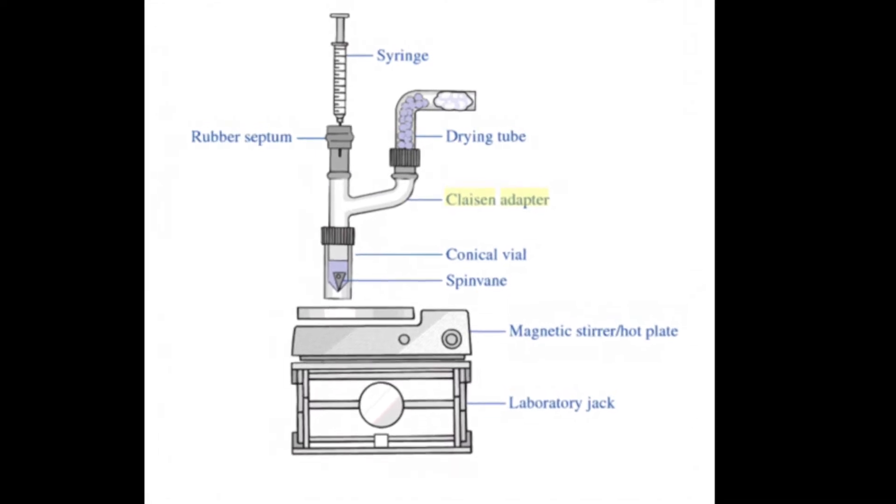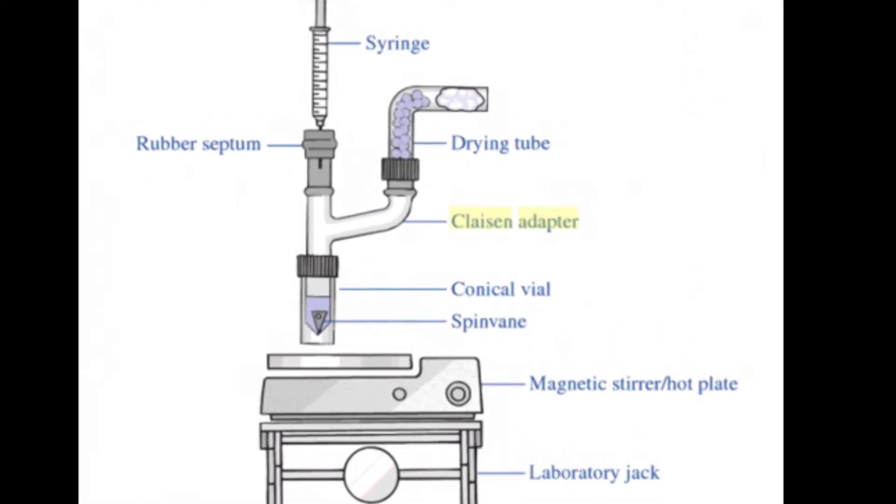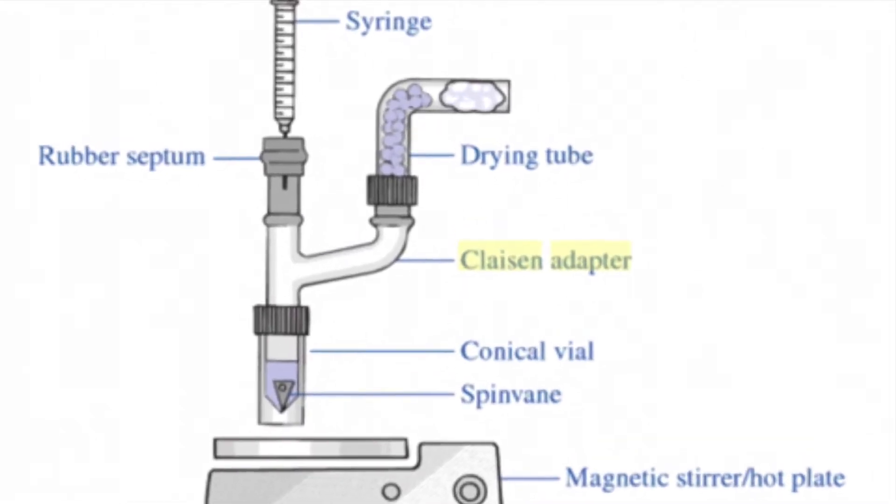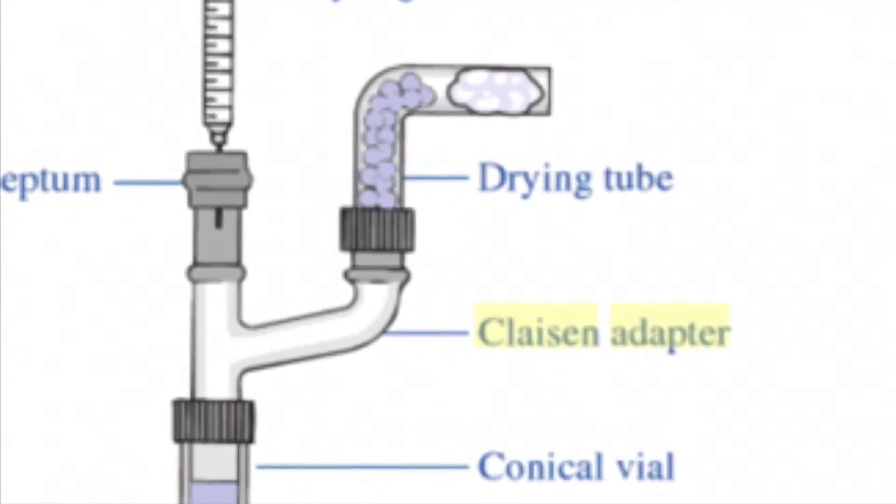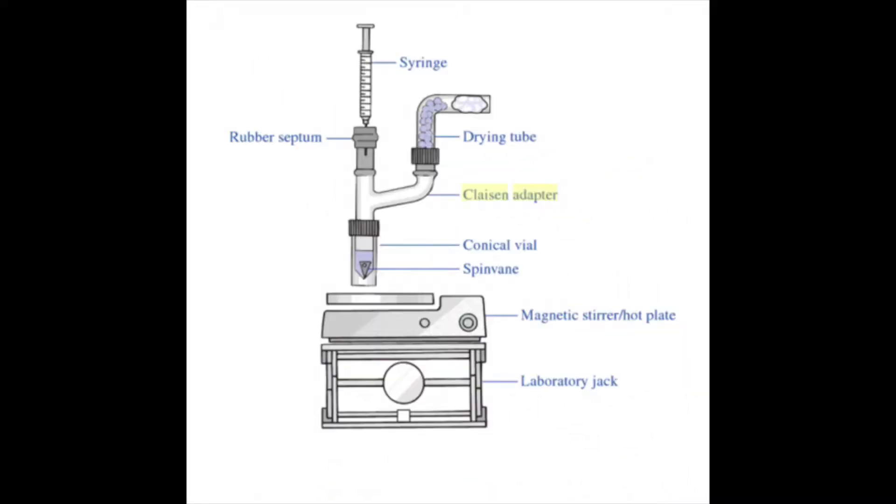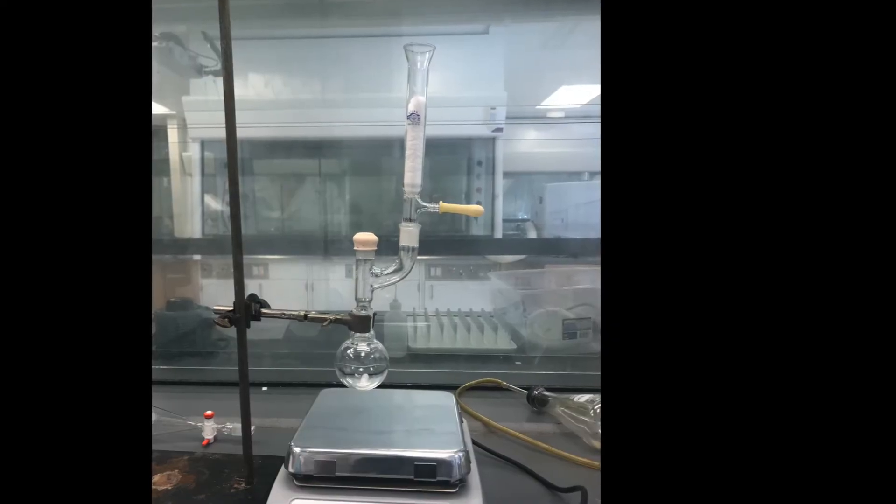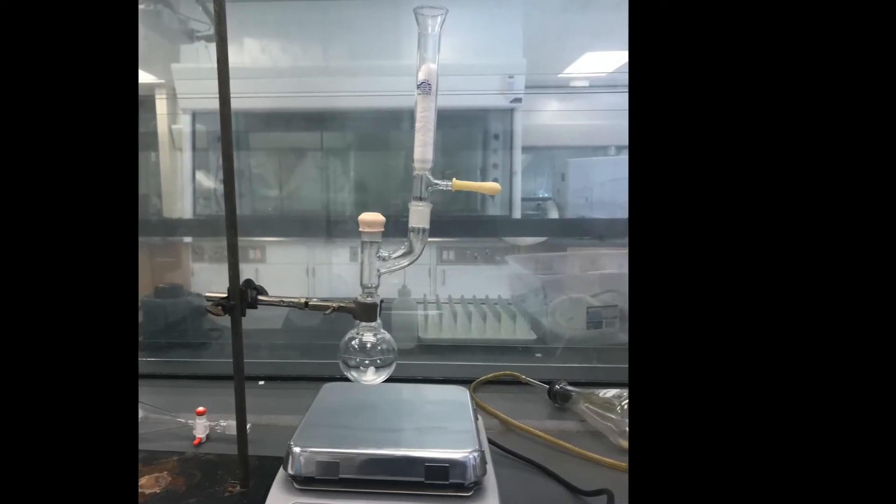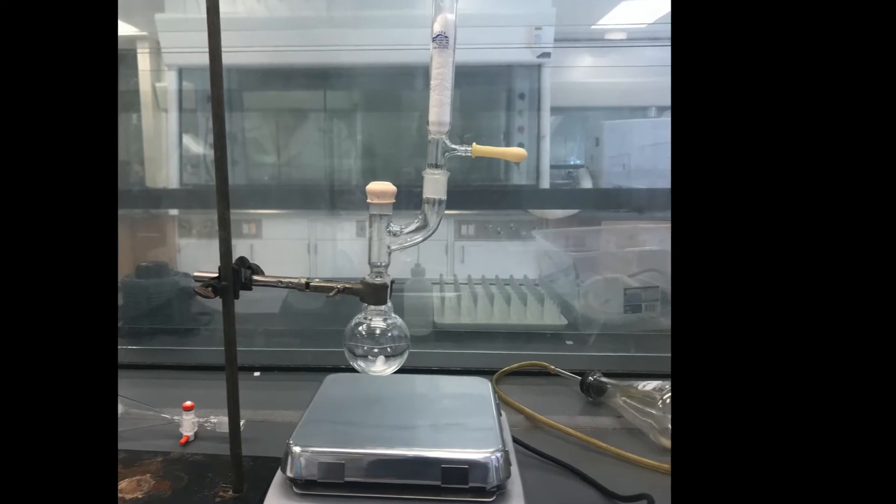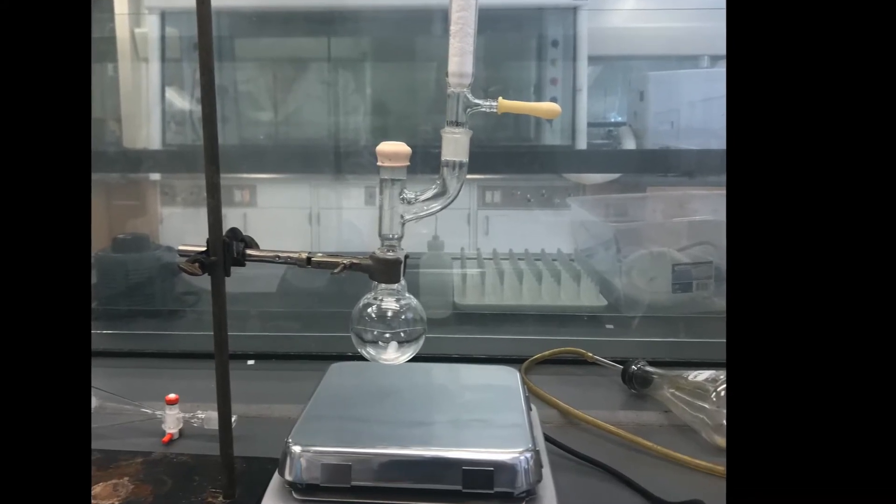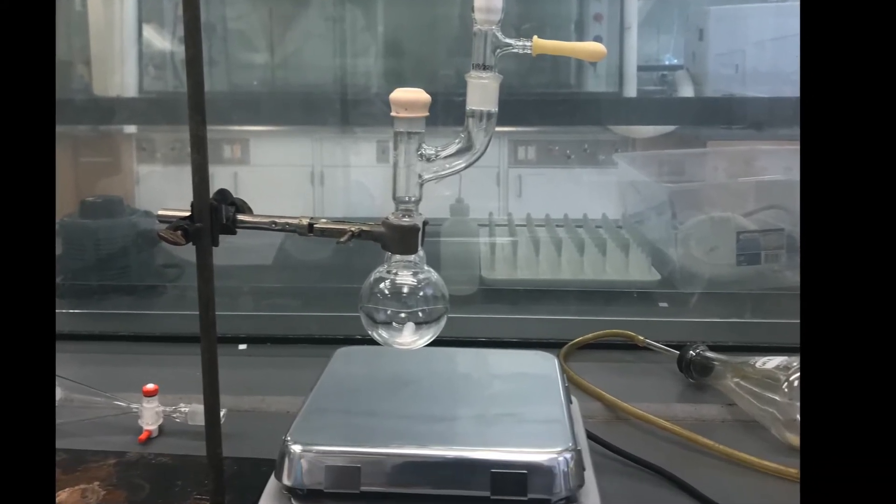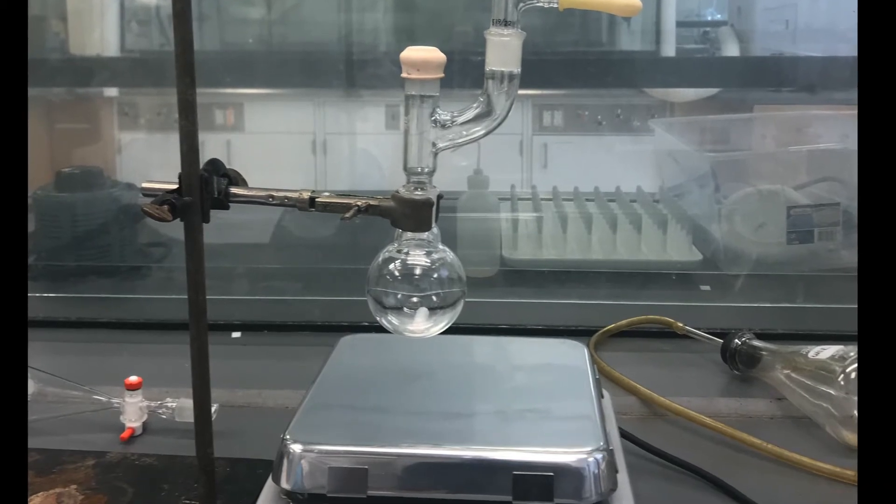In order to keep the reaction dry, we will use a closed system, including a Claisen adapter, a drying tube, and a rubber septum. I wanted to point out that the one discrepancy in this schematic is that we're using a round-bottom flask rather than a conical vial. Here is what your setup will look like with the round-bottom attached to the Claisen adapter with the rubber septum and the drying tube, set up over a stir plate so that we can stir our reaction as well.